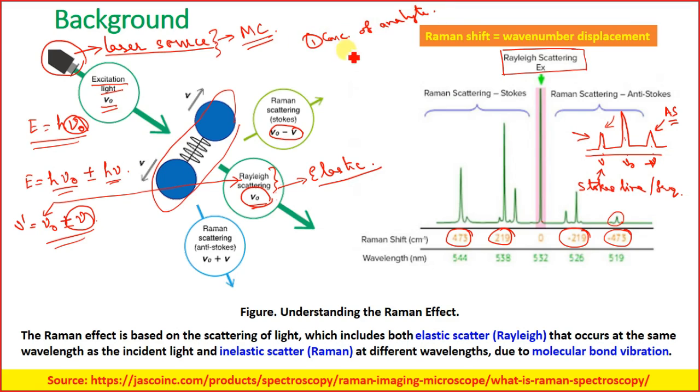So this is quantitative analysis. Also, I had said that in spectroscopy, each molecule exhibits a typical property, so that can be used for the identification of the analytes. So that is qualitative analysis.